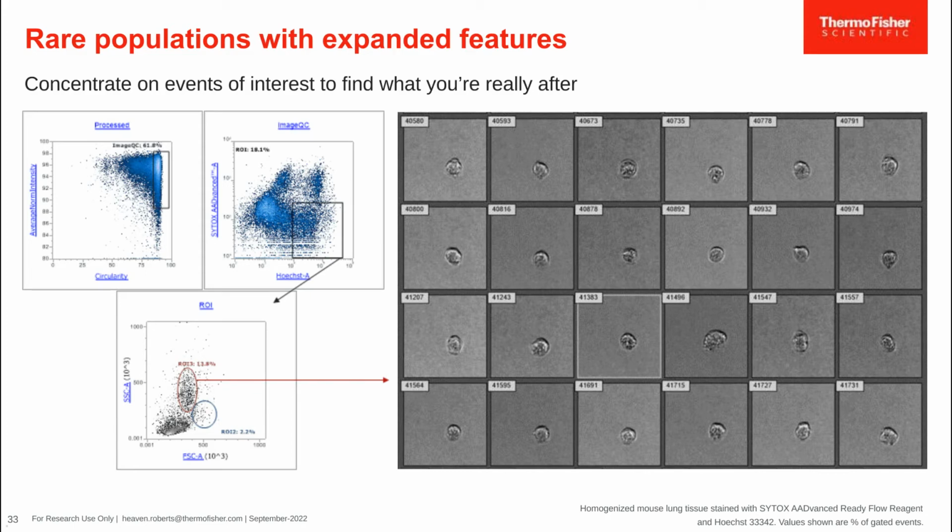So not only does this dramatically clean up the fluorescent plots with the nucleic acid and live dead staining, but you can see this really cleans up her scatter plots and just really makes this image view gallery look much more beautiful. These are the cells that we're after, and these are the cells that we want to titrate on. If we're titrating on cells that are dead or dying or have bits of aggregate, we're always going to find frustrations in those titrations, and ultimately we'll waste reagents and definitely waste time.